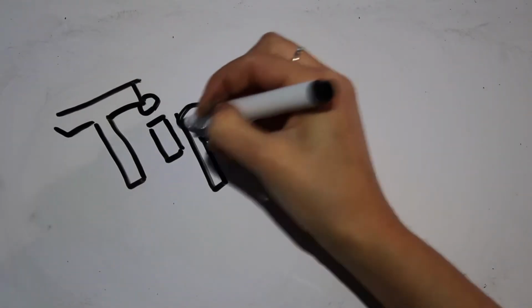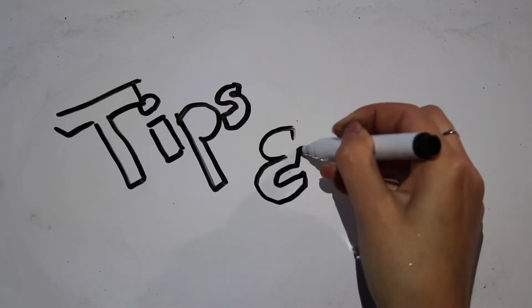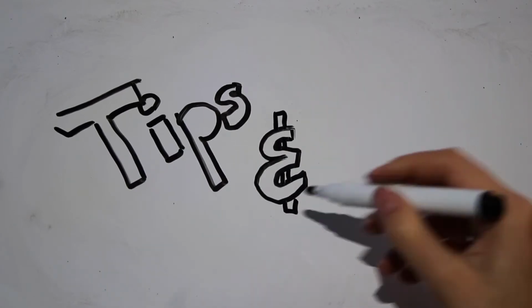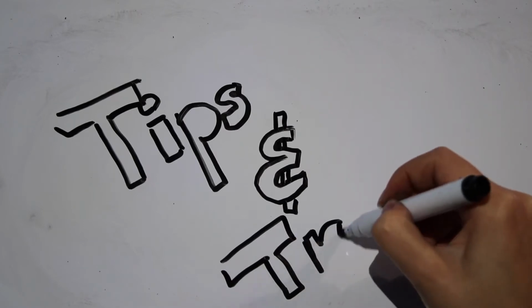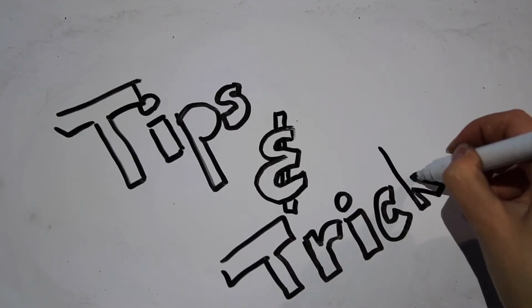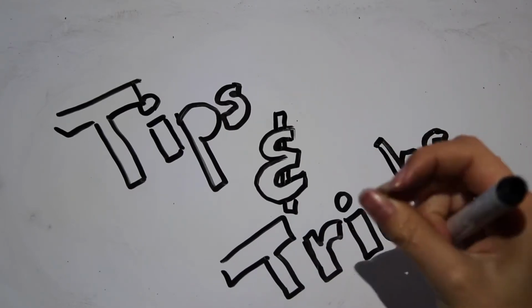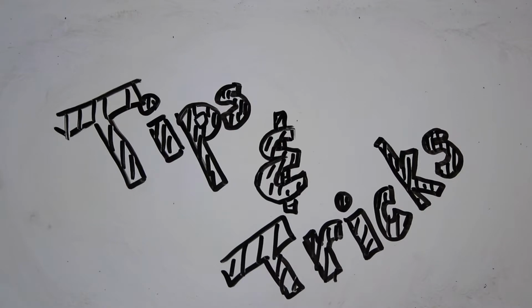Remember that only a very small amount of material is needed for melting point determination. You don't need to waste time by grinding more than necessary. Lastly, and most importantly, always quote a melting range. Seriously, it's not worth losing marks through forgetfulness.